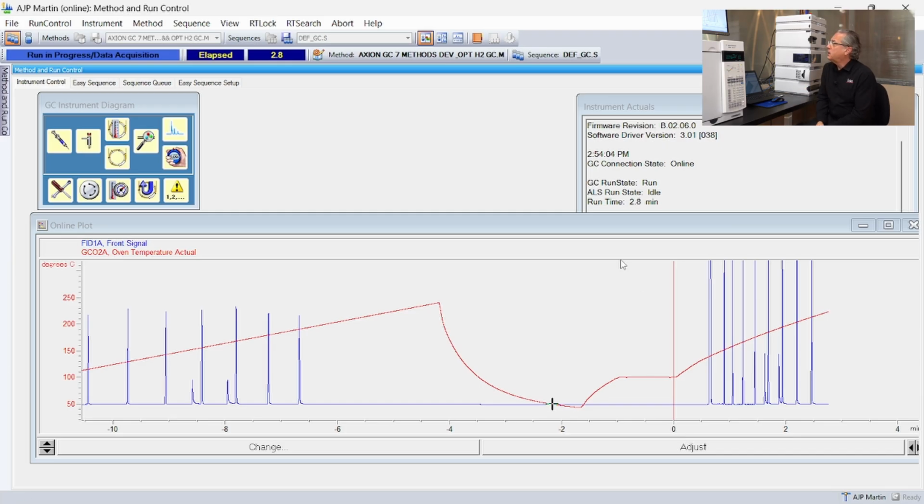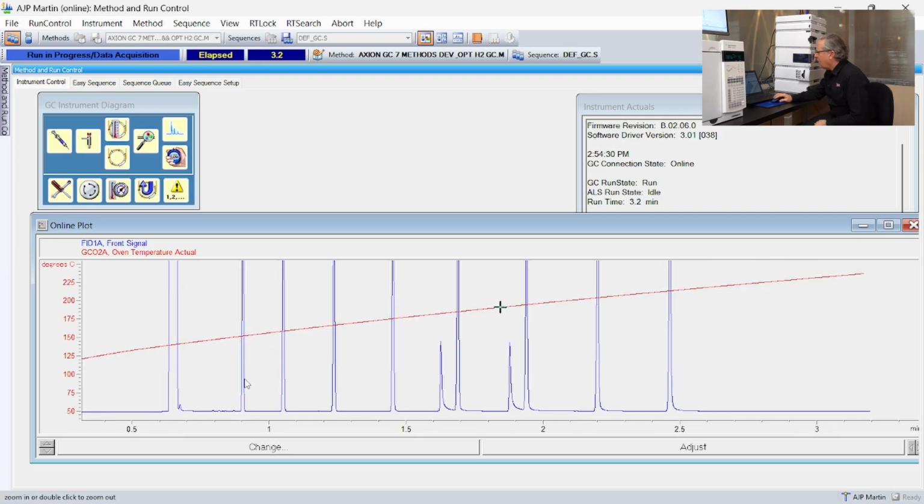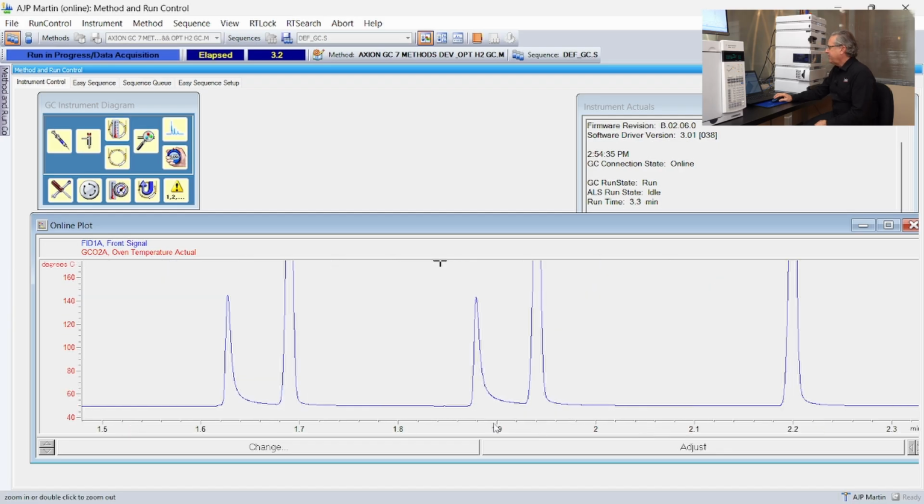Oh, sorry. I want to change that. So that's the last peak. Okay. So the camera's still rolling. So let's evaluate this chromatogram. Clearly, it's happening much faster, right? Instead of our previous run, we're running much faster analysis, just a little over 2 minutes. If we sort of zoom in, we can see our hydrocarbons are looking great. Unfortunately, those 2 alcohols are definitely, there's definitely an issue in here somewhere inside the GC.